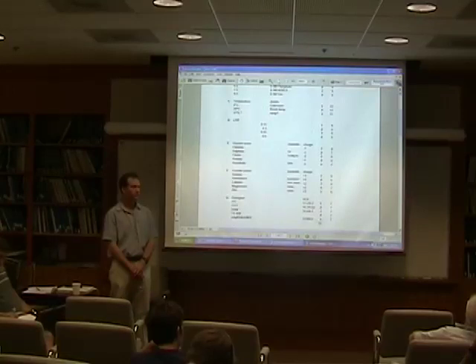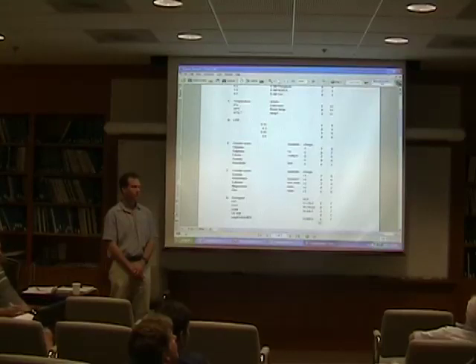He adds purified membrane protein with lipids and takes the detergent out with a lot of biobeads. And then he has either precipitations or membranes. And what he has, he puts on 2 molar sucrose and centrifuges that a few hours. The membranes swim on top and all the rest goes down.